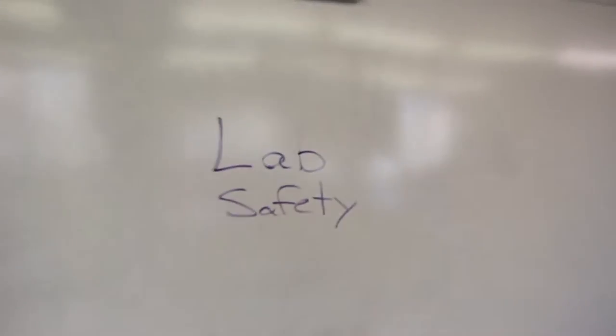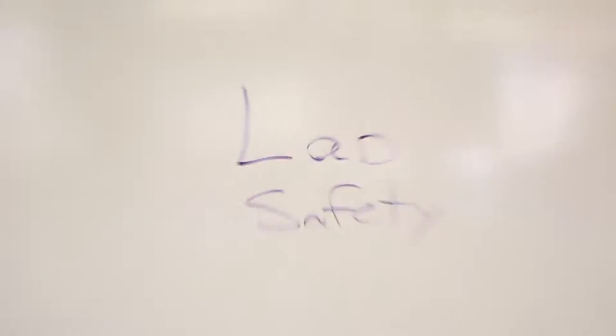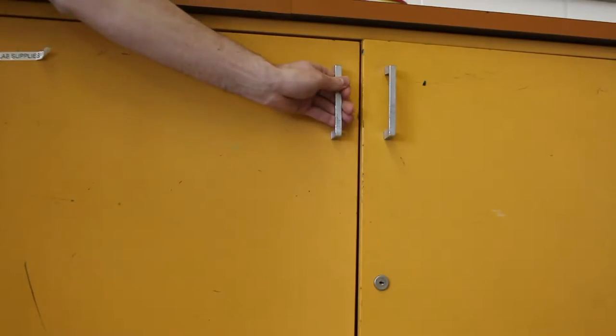Good afternoon, this is my lab safety video. The classroom I've been interning in for this semester is a very modest one, but there are several important things we need to mention about being safe. We're going to focus on some of the basics: using a fire extinguisher, a fire blanket, operating a hot plate, and handling glassware — four things.